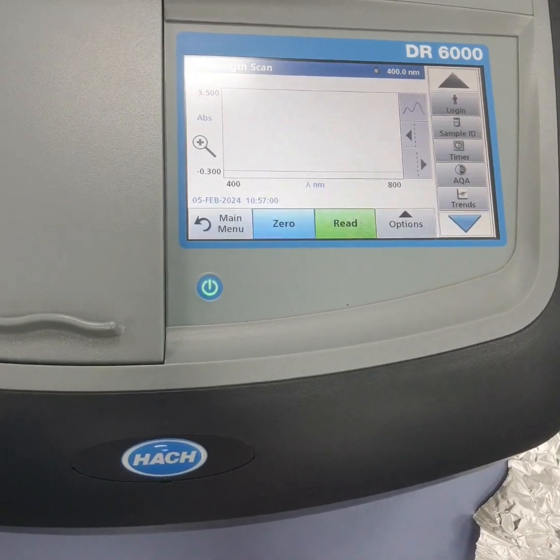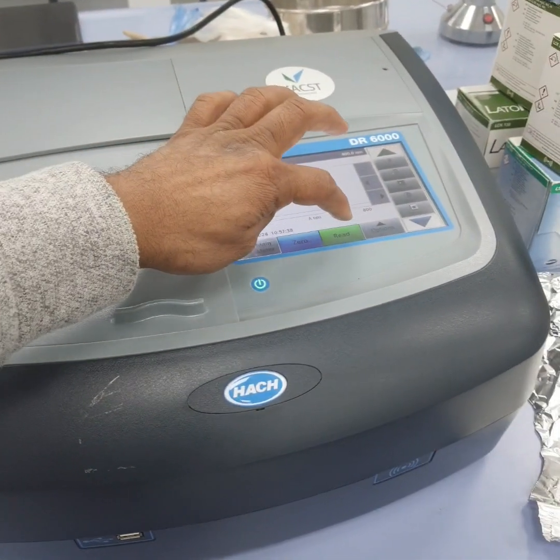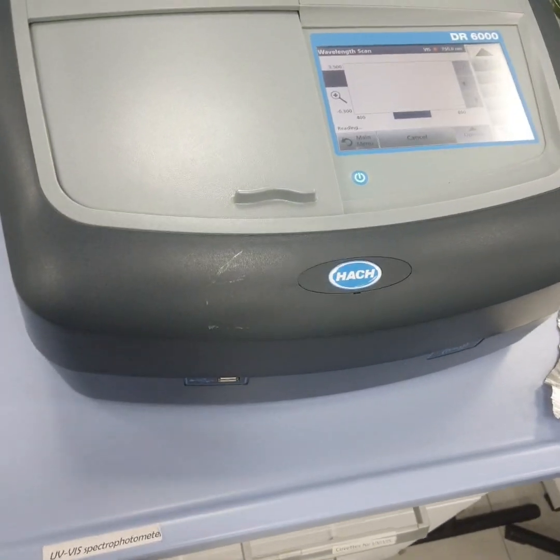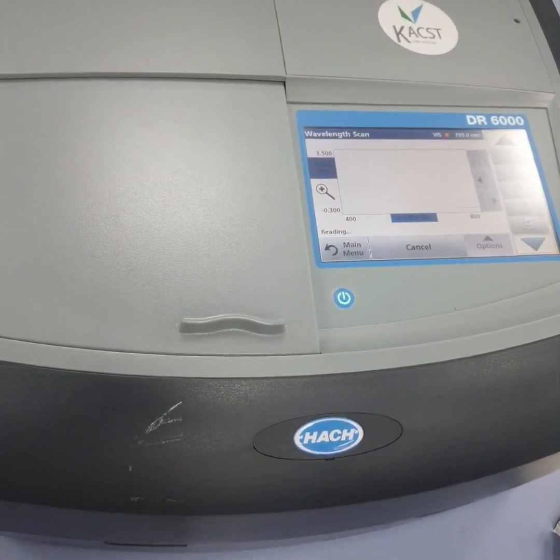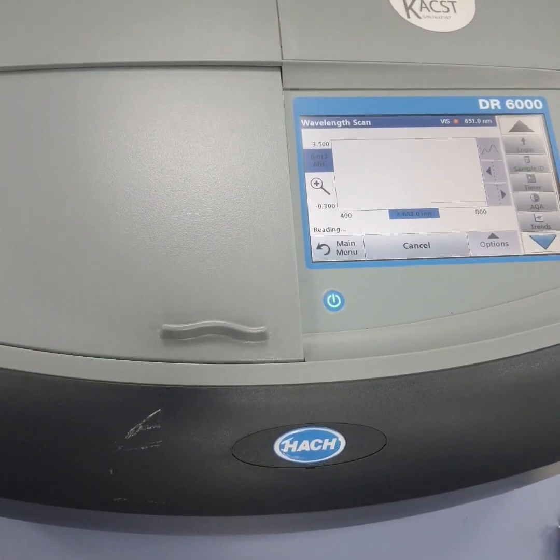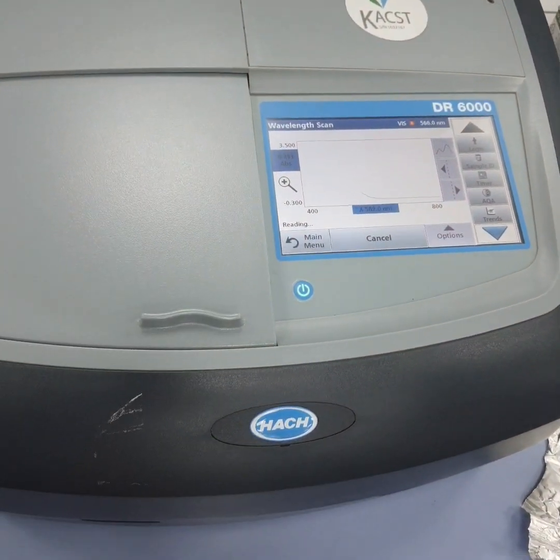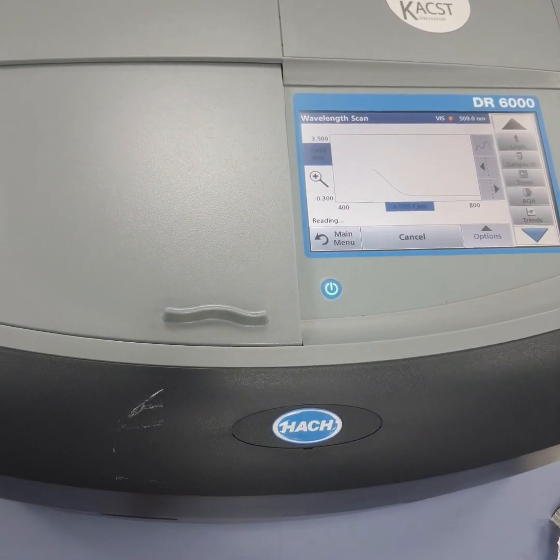Now we have put in the Congo Red, and then you will scan, read. Usually when you put the color first, this is your unknown, so there should be a reference, and usually water is the reference. You can come and see there is a peak now coming up. See, there would be a peak. Now it identifies the color based on the wavelength.